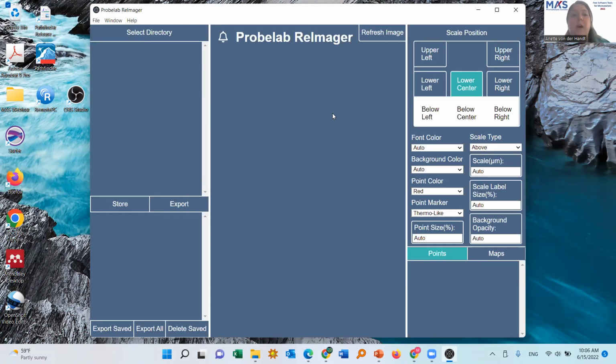One of its advantages in particular, at least to me as a lab manager, is that it is platform independent, meaning that it was coded in Node.js, so it's more like a web browser, and it runs on various Windows versions, and Macs, and also Linux.